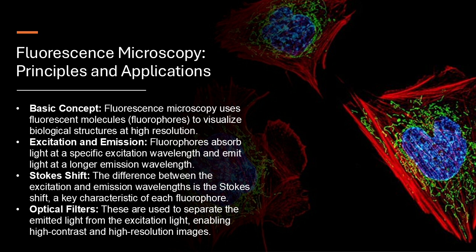Well, one area that's really pushing the limits is super resolution microscopy. Think about it. Traditional light microscopy has a resolution limit, meaning we can only see objects down to a certain size. But super resolution techniques are breaking that barrier, allowing us to resolve details that were previously thought to be impossible to see with light. Wait, so we can actually see things smaller than the wavelength of light? How is that even possible? I know it sounds like something out of science fiction.